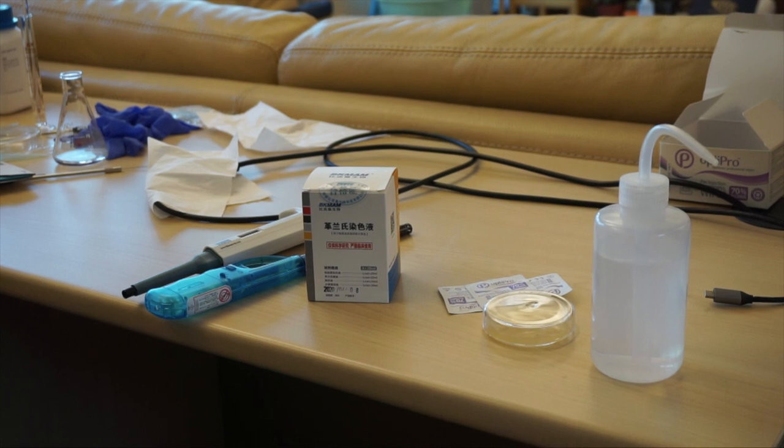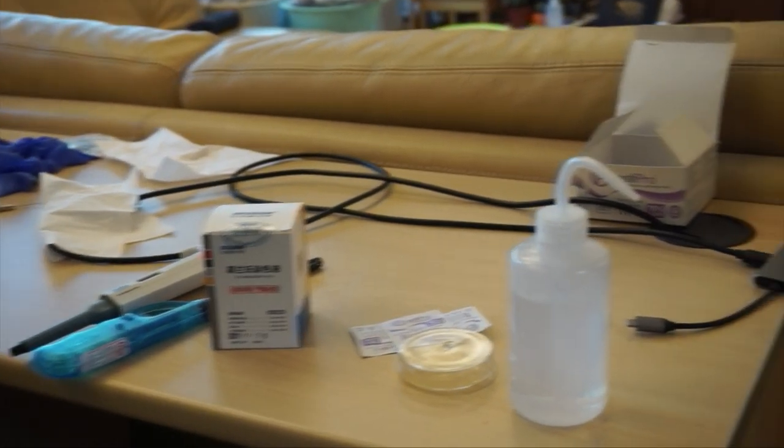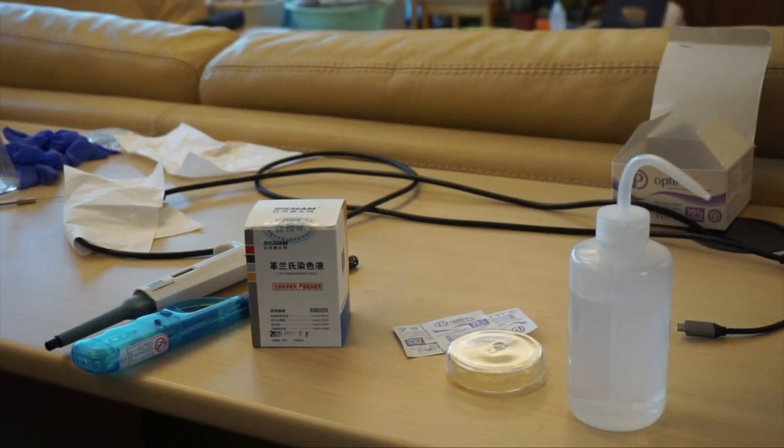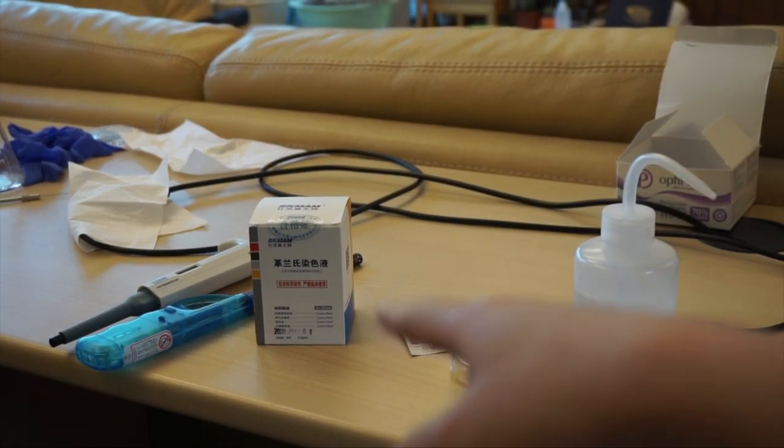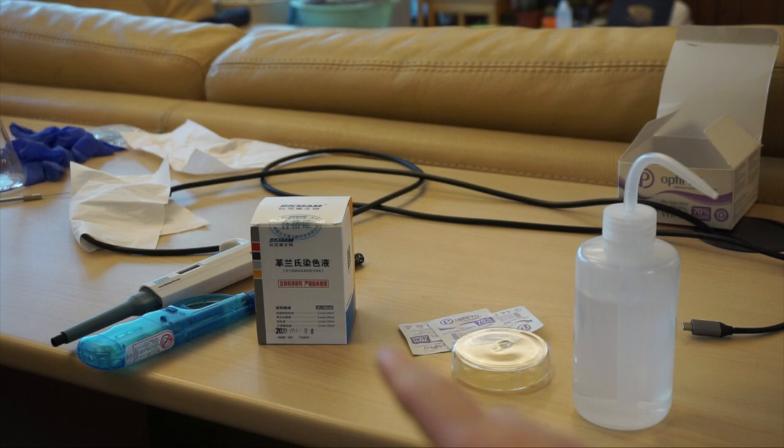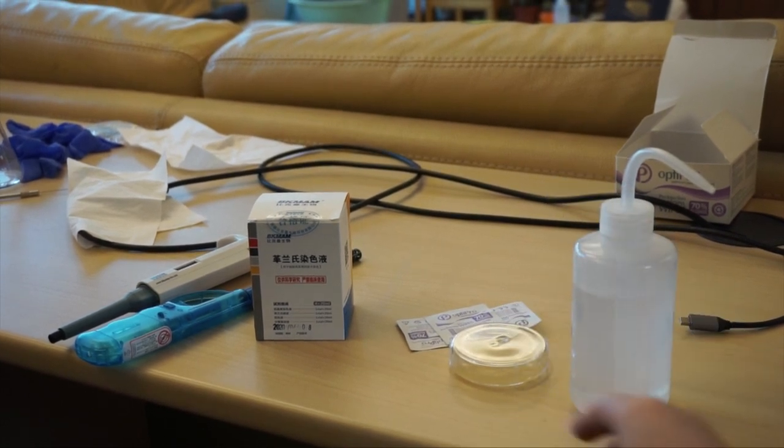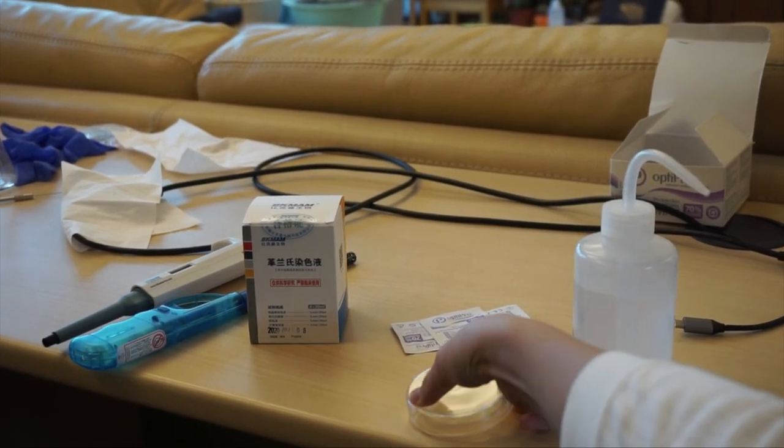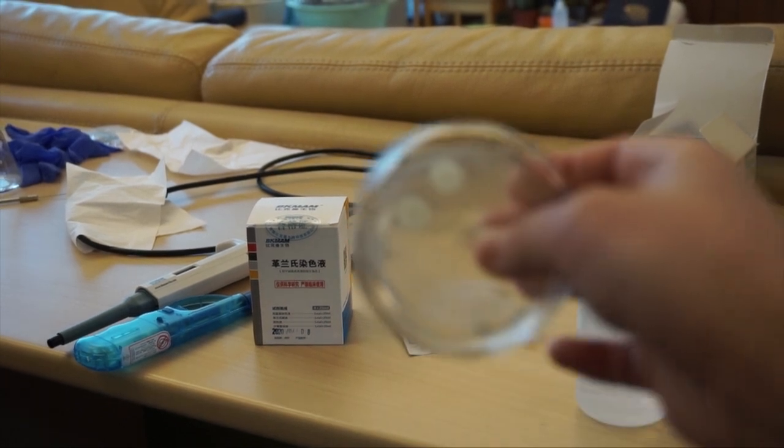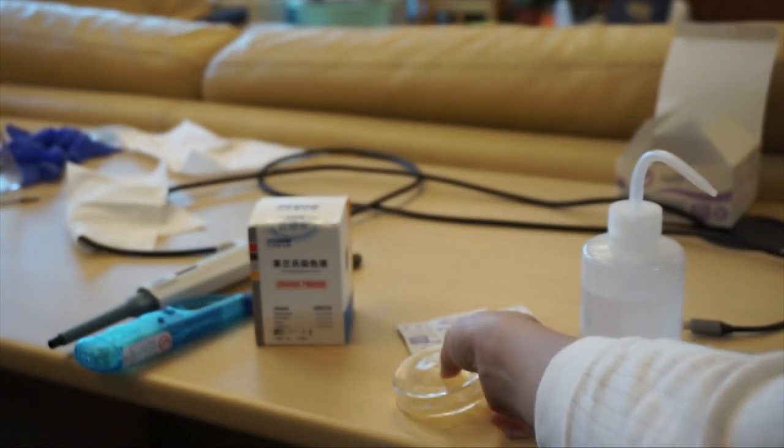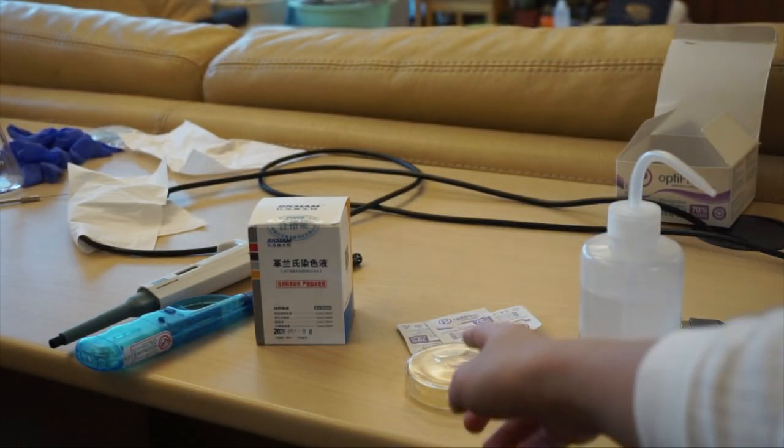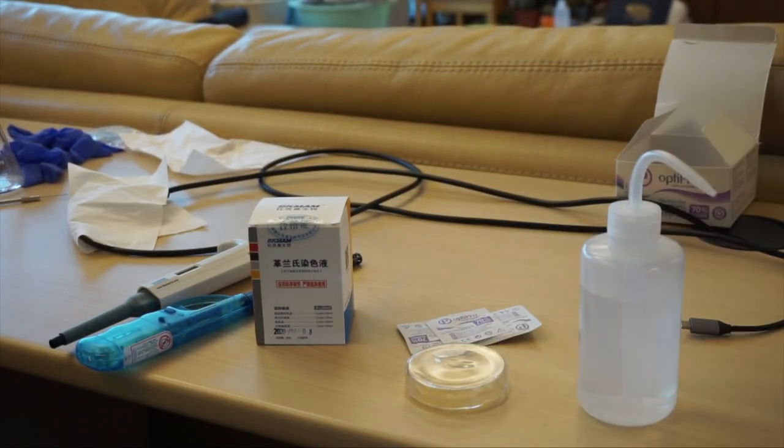So these are the materials we're going to need. This is stain. I bought that on a website. Distilled water, your bacteria colony, and some alcohol wipes for cleanup.